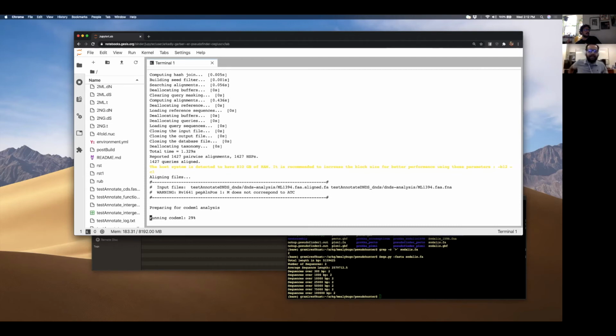It's really interesting, and one thing that you want to consider if you are running Pseudofinder and you provide a reference genome, is that you have to really think about that reference genome. Is it really a good reference? The reason I'm providing Mycobacterium tuberculosis here is because it doesn't appear to have a lot of pseudogenes. If you run Pseudofinder with RefSeq, it doesn't appear to have a lot of pseudogenes, and it's relatively closely related to leprae. But it does have some pseudogenes.